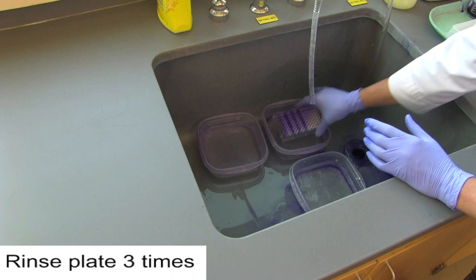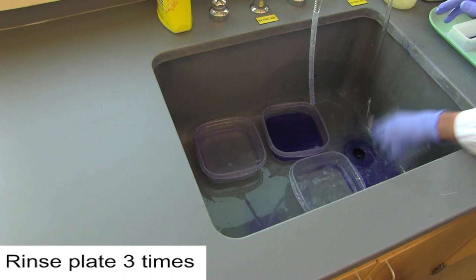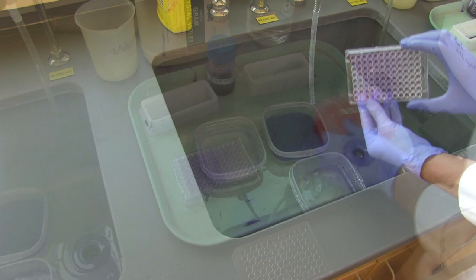With water running, shake out the excess crystal violet, then plunge the plate into the first container, pour out the crystal violet, and repeat with the second and third containers.